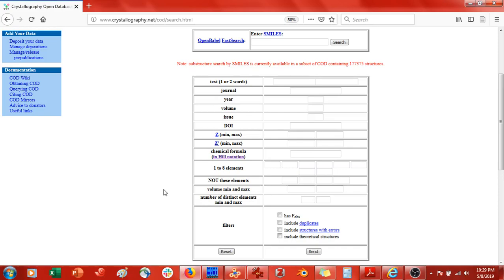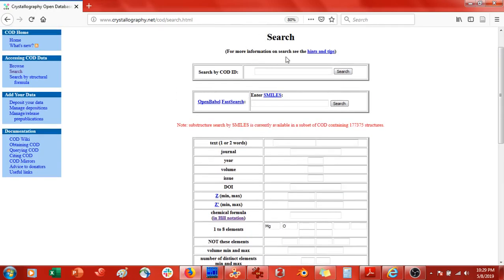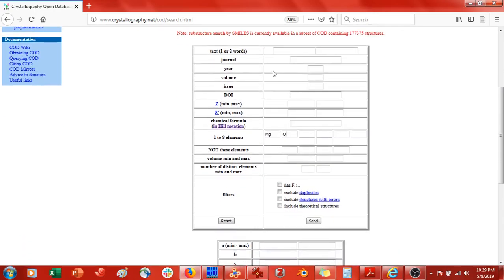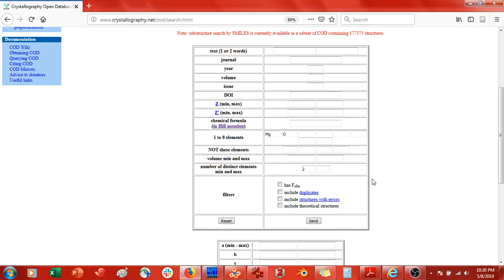So today we're going to find two crystal structures. We're going to find carbon-60, and we're going to find something else — let's find magnesium and oxygen. You come to the search area in the center. What you want to do is type in the elements you want, and then specify the number of distinct elements — so you'll type in two. This way, the crystal structures shown are only magnesium and oxygen.